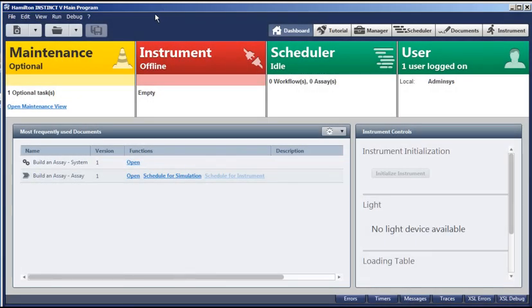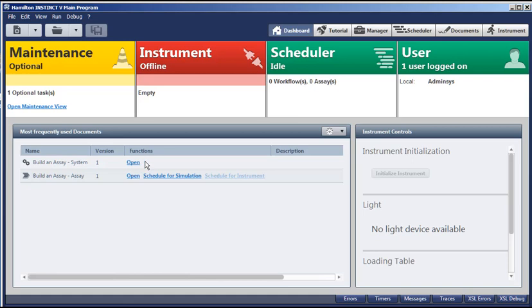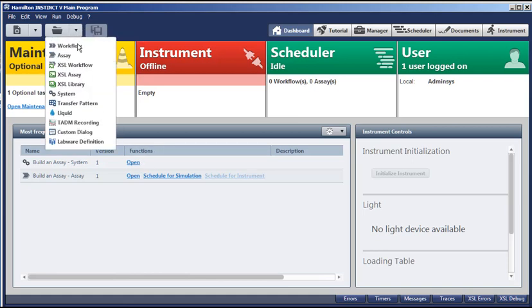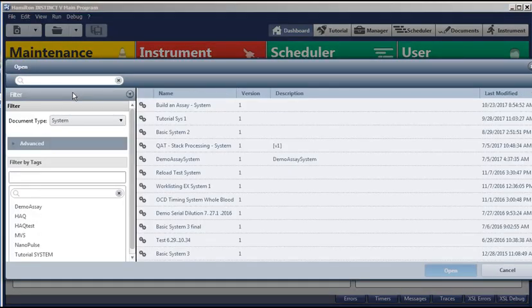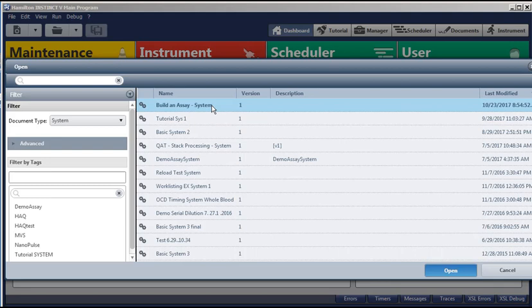After logging in, the dashboard appears. And from here, we can open an existing system document like you see here. Or we can use the QuickDoc button right here. Select System. And from the list, we'll select Build an Assay System, which is already created for this video and for the assay we're going to build. Click Open.